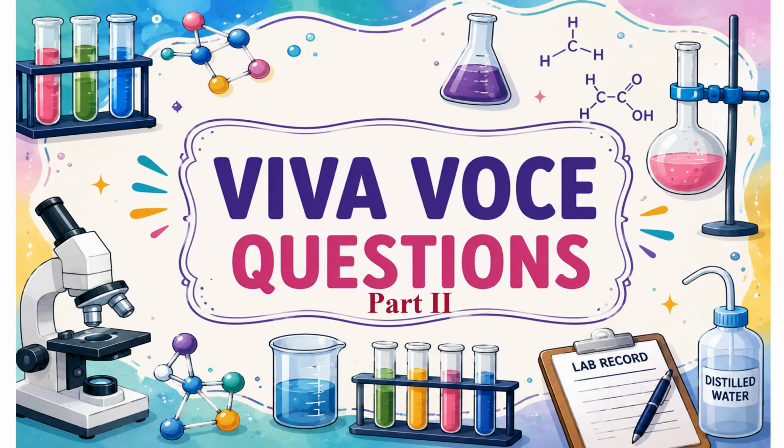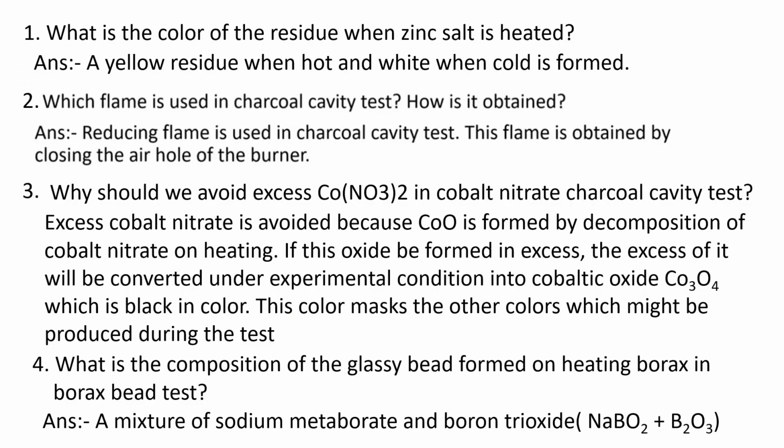Now coming to the second part of Viva Voce questions. Another 8 questions, you will find here. Questions with answers are given. I'm not going to read out the answers. First question, what's the color of the residue when zinc salt is heated? Second question, which flame is used in charcoal cavity test? How is it obtained? Third question, why should we avoid excess cobalt nitrate in cobalt nitrate charcoal cavity test? Fourth question, what is the composition of the glassy bead formed on heating borax in borax bead test?